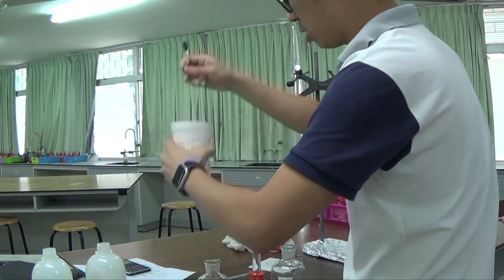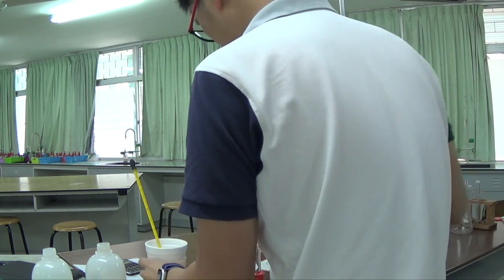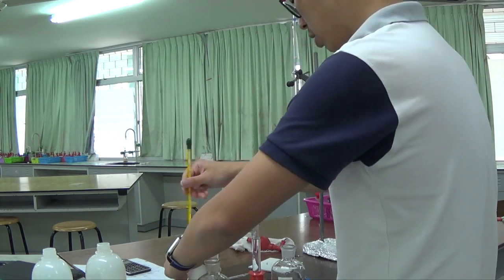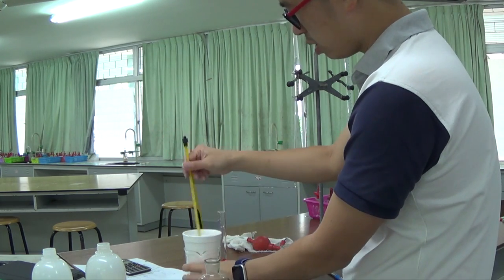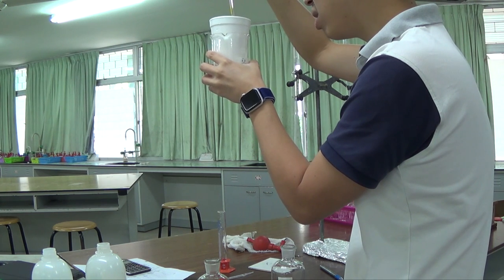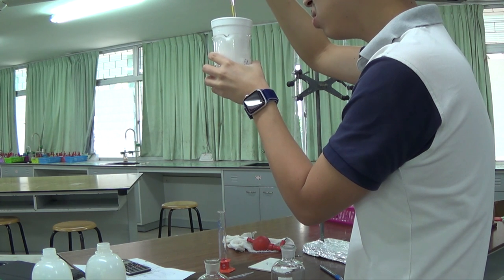I read my initial temperature. Today is 22.0, so it seems that 22.0 looks like the equilibrium temperature in this room, I guess. Pour in the solution and stir very gently with the thermometer. And the temperature has gone up straight to 31.5. Does it go to 32?